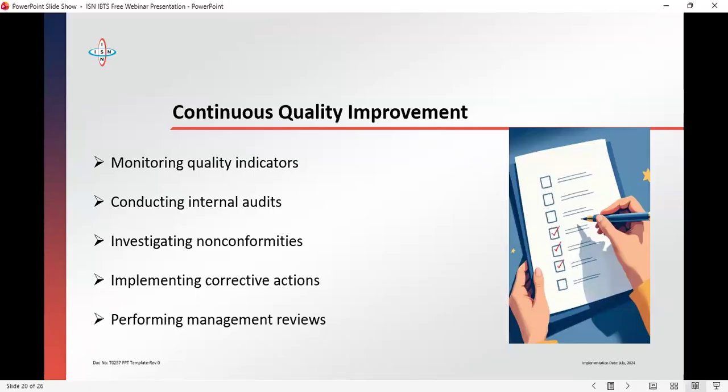Continuous improvement cannot be overlooked. The essence of all these things is to improve the process by monitoring quality indicators like your turnaround time and rate of rejection. If you notice that a particular hospital, if you're a referral lab, or a particular ward in the hospital is giving you hemolyzed samples, it behooves you to approach them to tell them that over 3 months now, all the samples we receive from you are hemolyzed. Please, how do you collect these samples so that this doesn't happen?